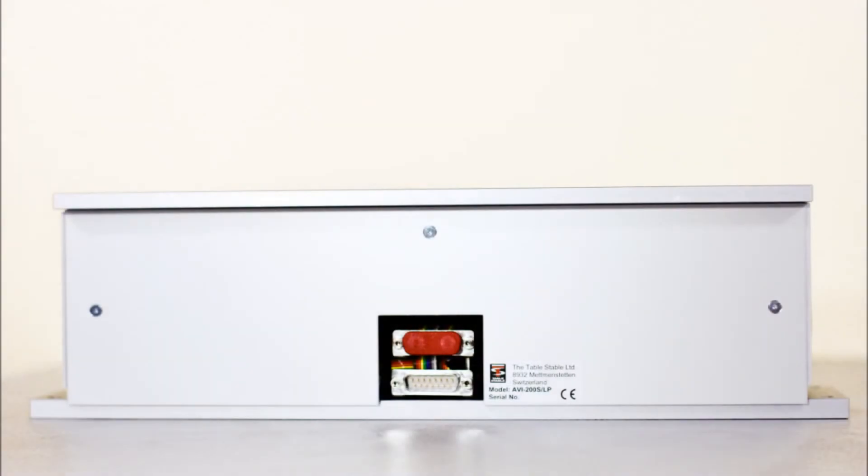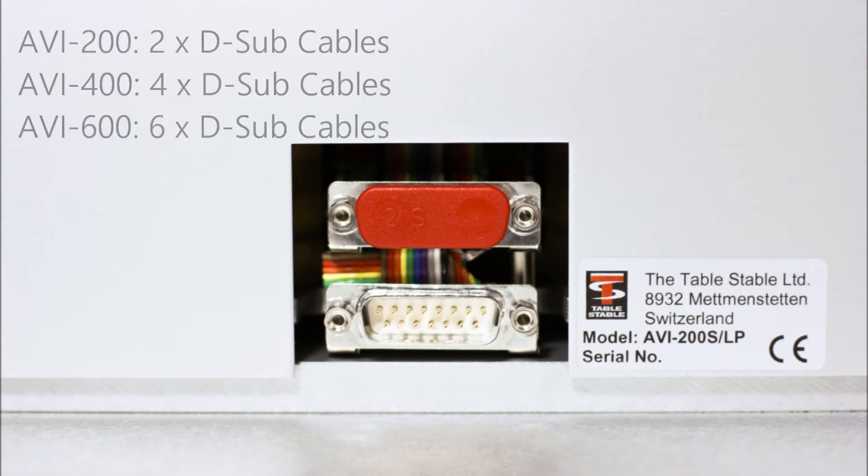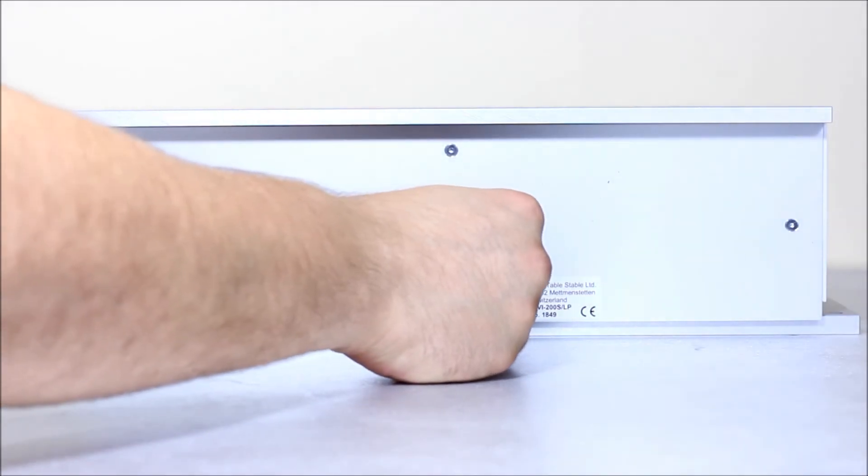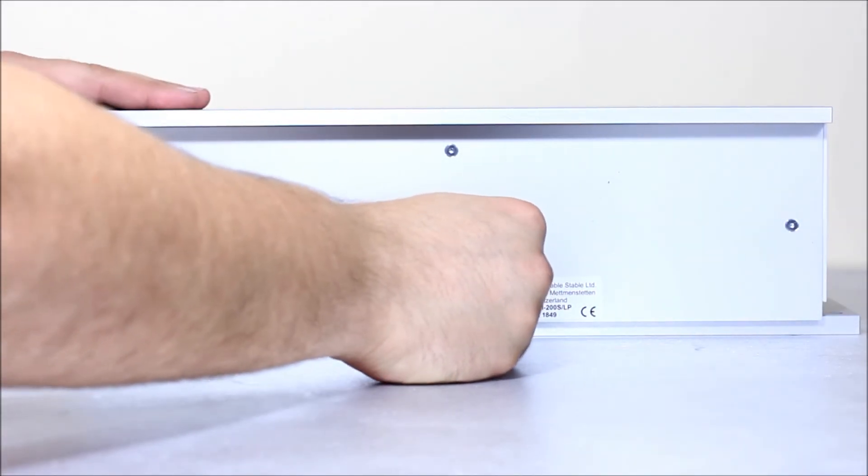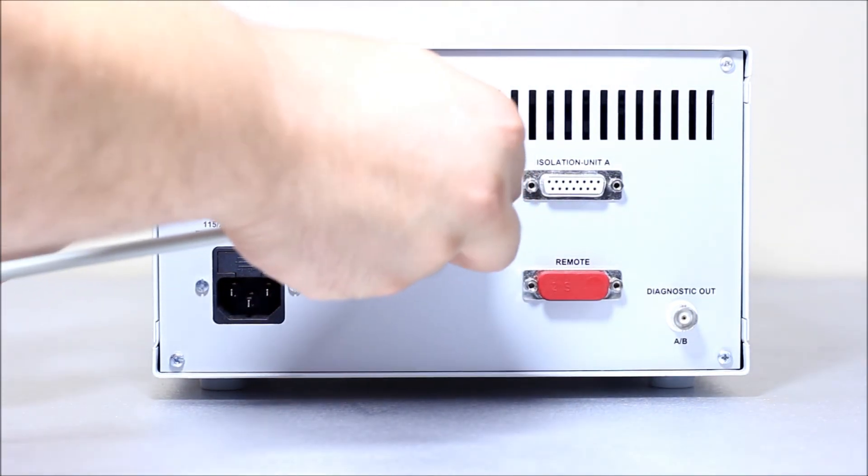Once the AVI modules have been properly adjusted to account for the instrument weight, the next step is to connect the modules to the AVI controller. Each AVI module has a specific number of D-sub cables needing to be connected to the AVI controller. Connect one end of the D-sub cable to the input found on the AVI module and the other end of the D-sub cable to the input found on the AVI controller.